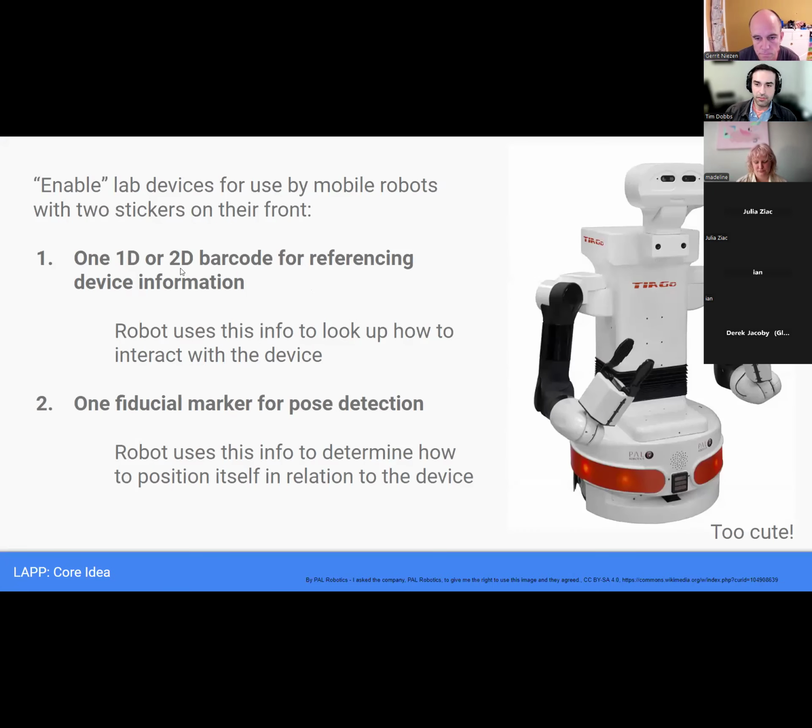So how do they try to solve that? Well, they basically imagine that you're going to use a mobile manipulator robot. So like this cute little guy. He's got little wheels, and then he has, in this case, two manipulators. They seem to like two manipulators, but you could do one. And their claim on this is that it's too idiosyncratic, all these different instruments. And so they say, well, if you just get a robot, it solves a handful of problems.